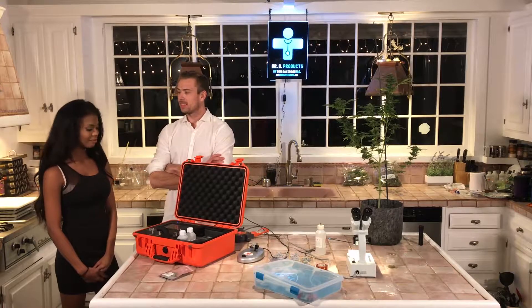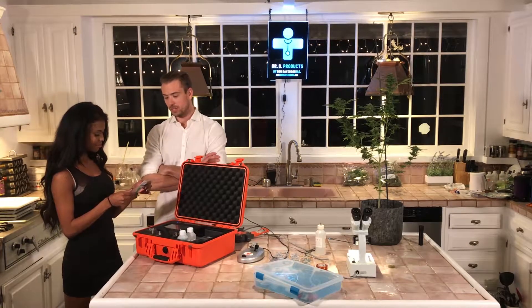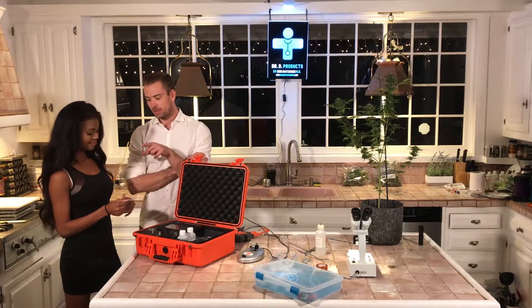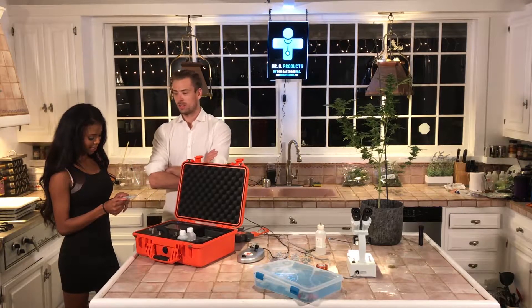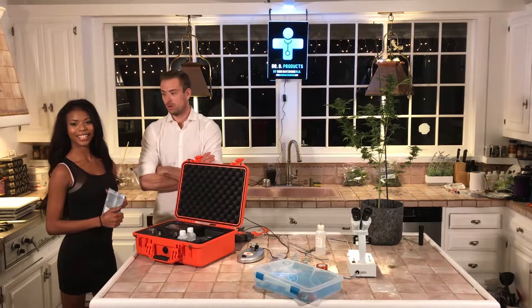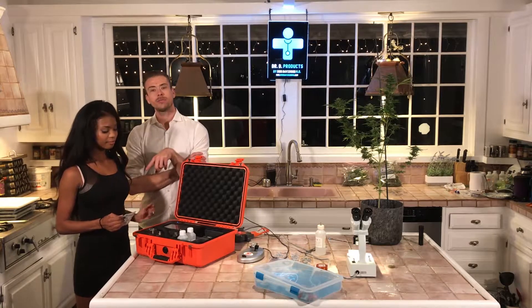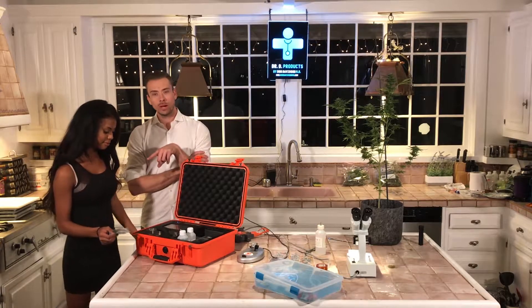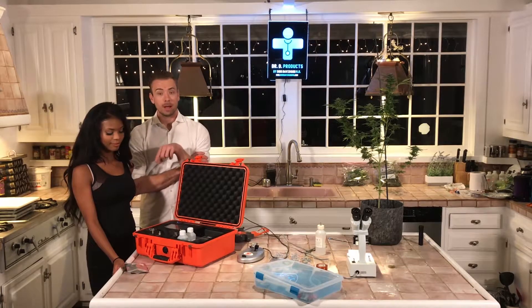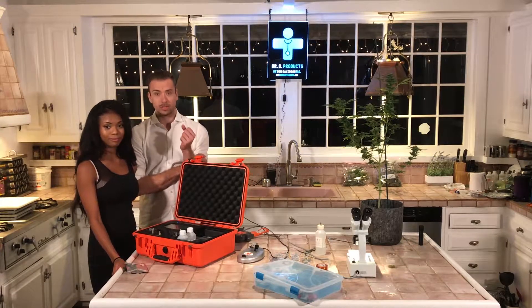Nia, so what did you buy today? You're a medical patient using this for some different aches and pains. You want to test it to see if you got what you paid for — specifically a 1-to-1 ratio of CBD to THC in the flower, which is actually what she was able to find and buy. That's kind of a rare flower, so we actually want to verify if that's truly what this is.